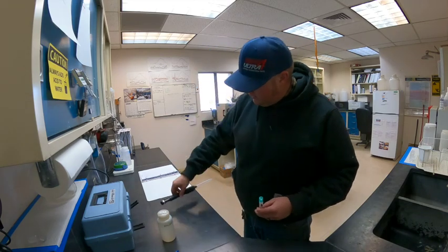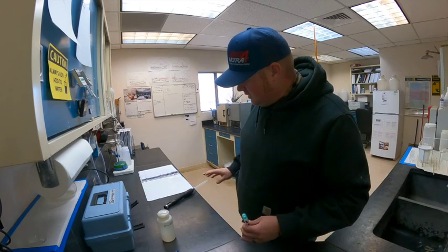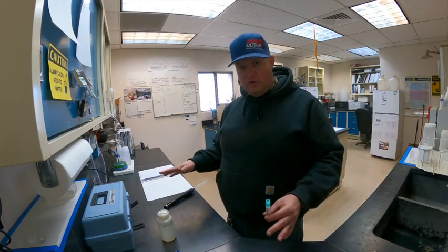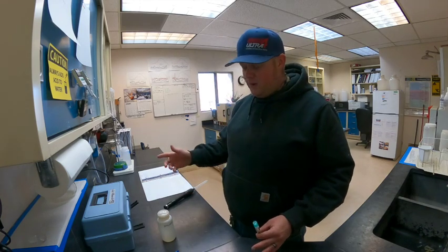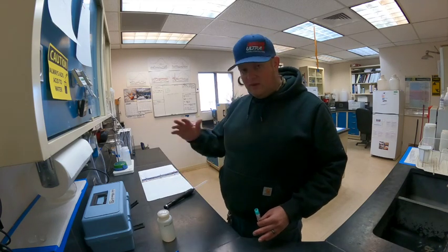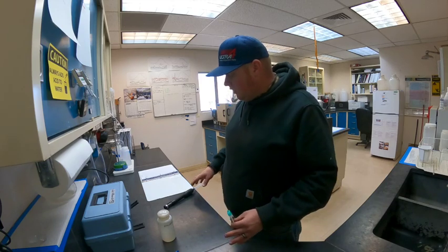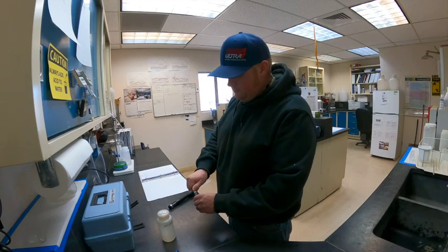Whenever I'm using these, I always set these in such a way so my tip doesn't become contaminated with anything. Like I said, the process control is a lot more loosey-goosey, but when we're actually doing compliance, we're really careful, especially if we're doing a sensitive test like phosphorus. Phosphorus is really sensitive to any kind of outside contaminants, so you gotta be really careful of your tip. You know, we're wearing gloves, stuff like that.